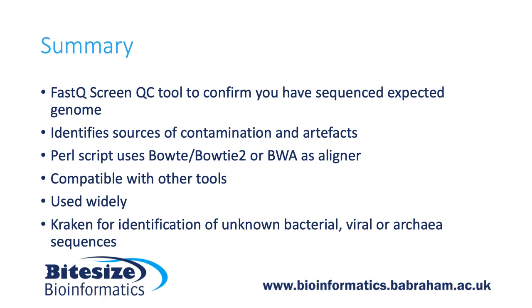We use FastQ Screen widely at our institute, and we know it's being used outside the institute as well. If you don't know the source of your contamination and really can't guess at it, then we recommend using Kraken as a way of identifying the source of contamination. Kraken is a metagenomics tool and contains an exhaustive database of bacterial, viral, and archaeal sequences. Using Kraken in conjunction with FastQ Screen should help you identify, hopefully, most sources of contamination in your datasets.